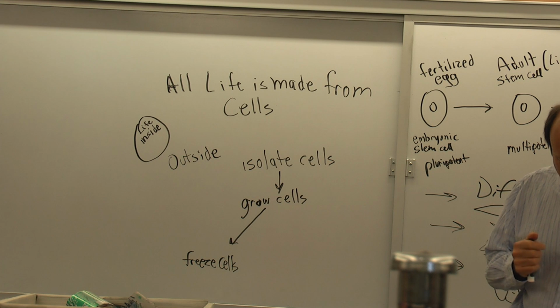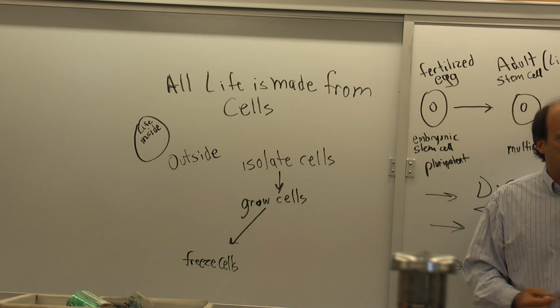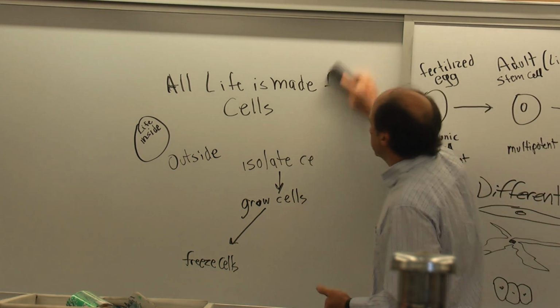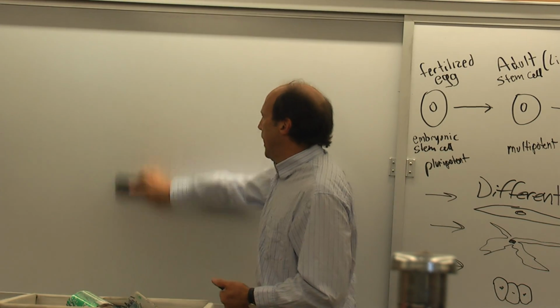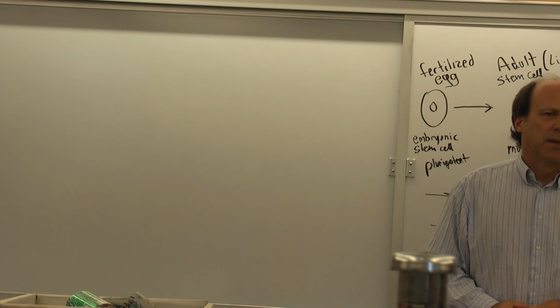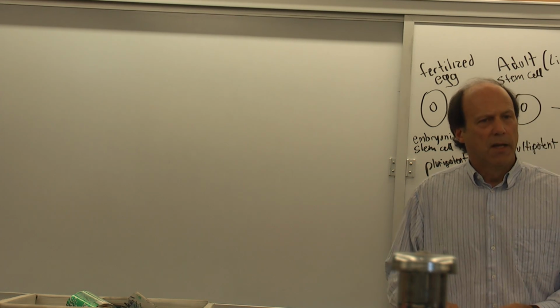I think this is kind of interesting, because you guys are doing growth curves, right? So is there some limit to cell growth? Can you keep going? Week after week, you guys have come in here several weeks, and you've been counting cells. And you're going to do that again today, because we do that as an ongoing part of the lab. So we're doing the new topic, but we're also constantly doing these growth curves.